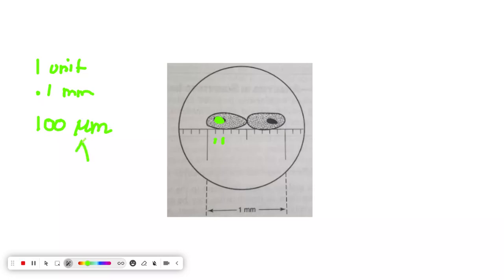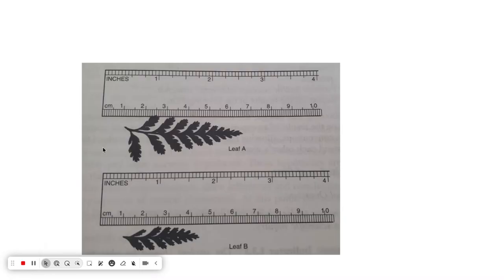I'll show you that mu symbol. It's a better version of the mu symbol over there. It disappeared. Bring it back. So right here, that's mu, right? Symbol for micrometer.